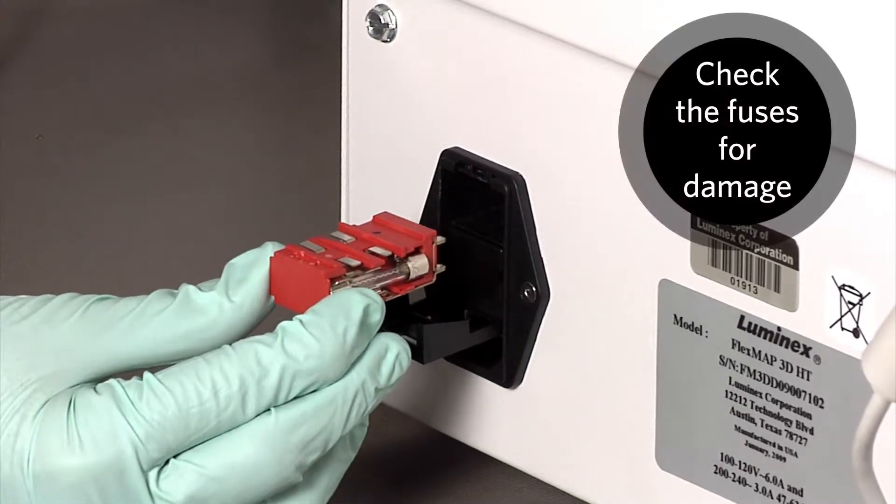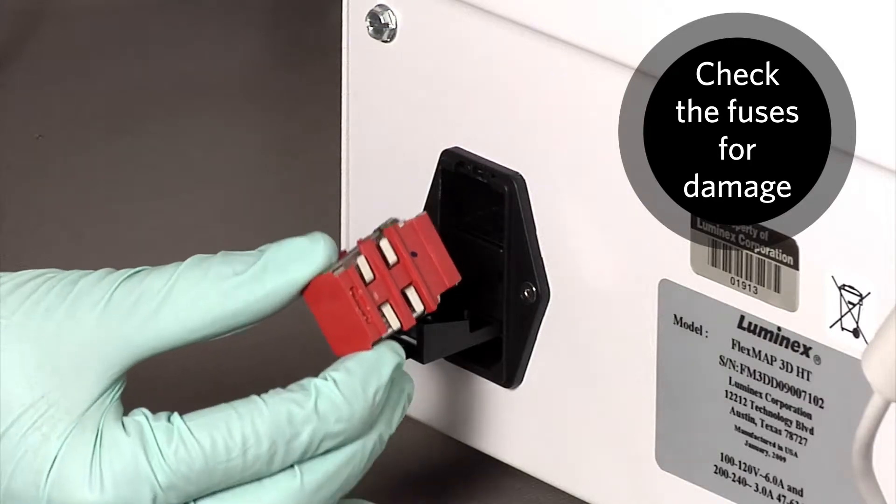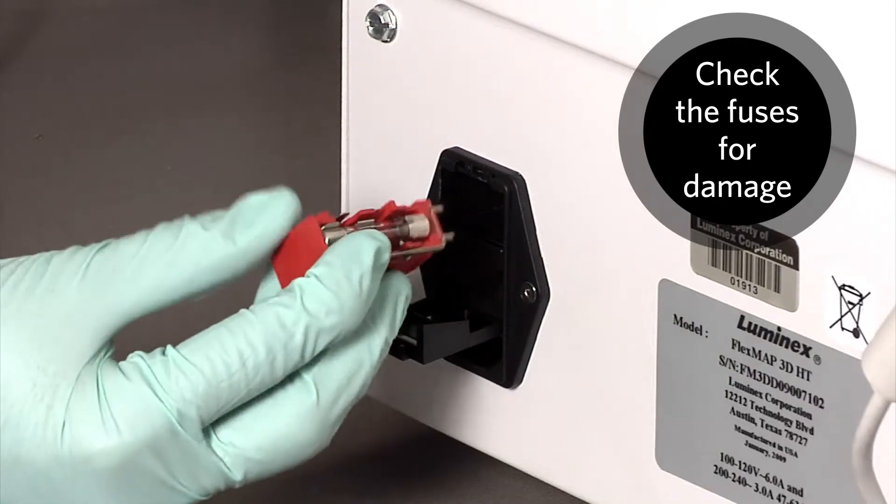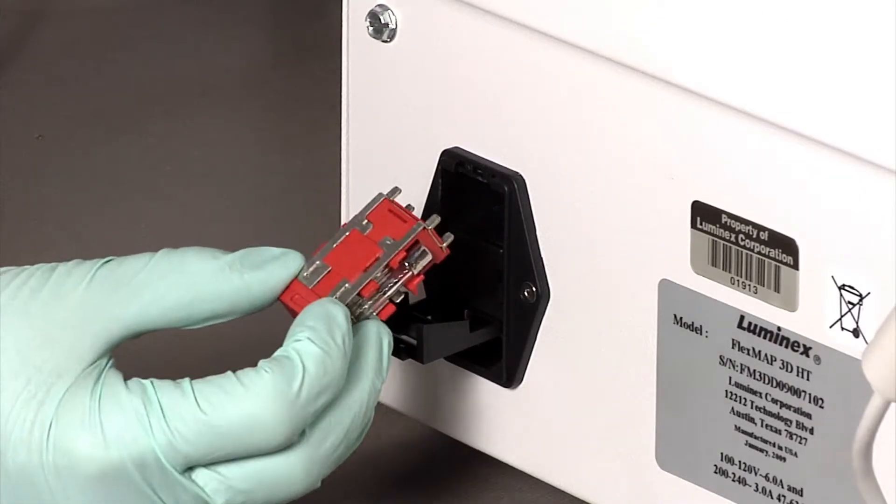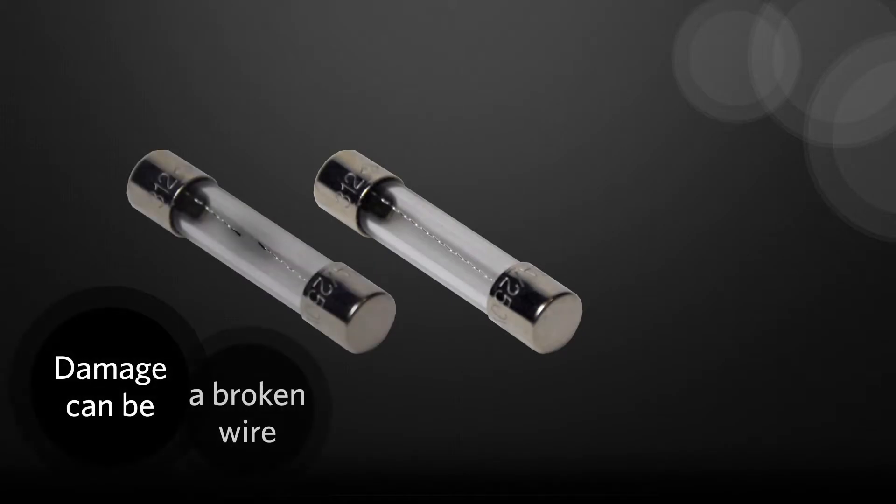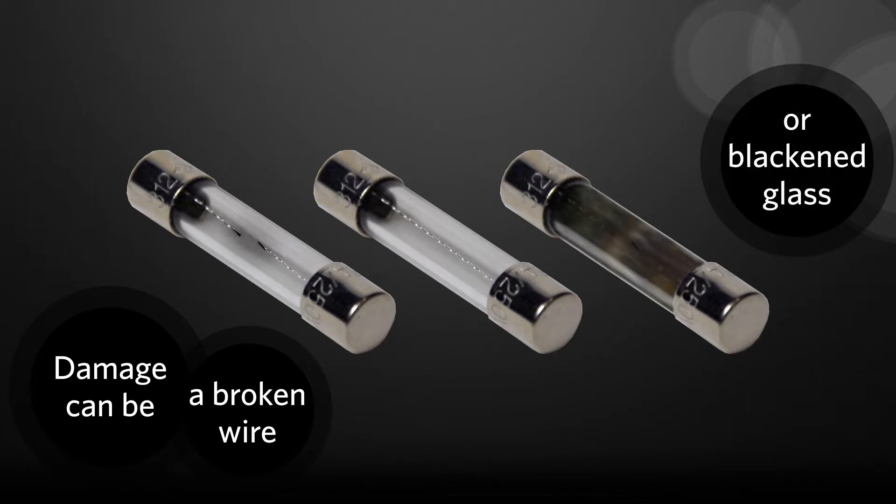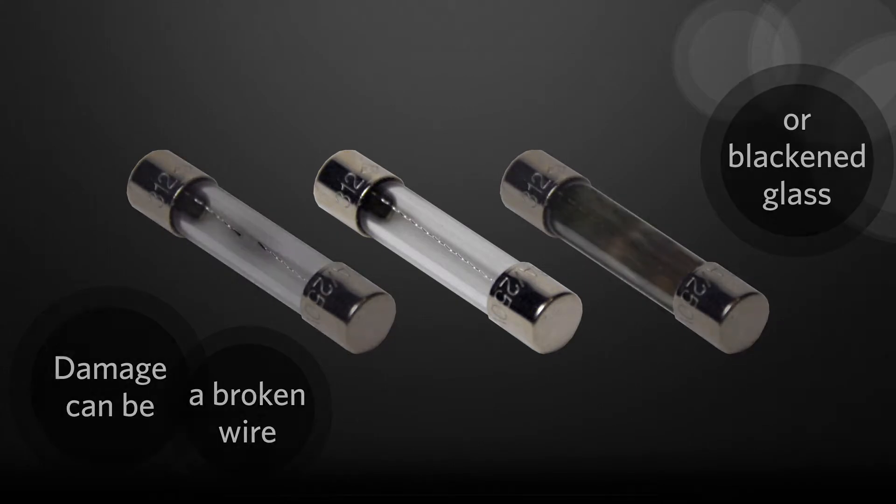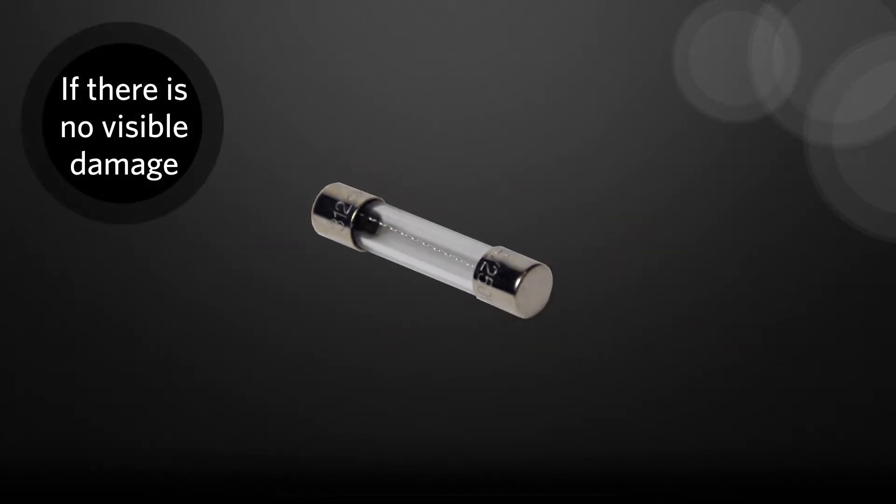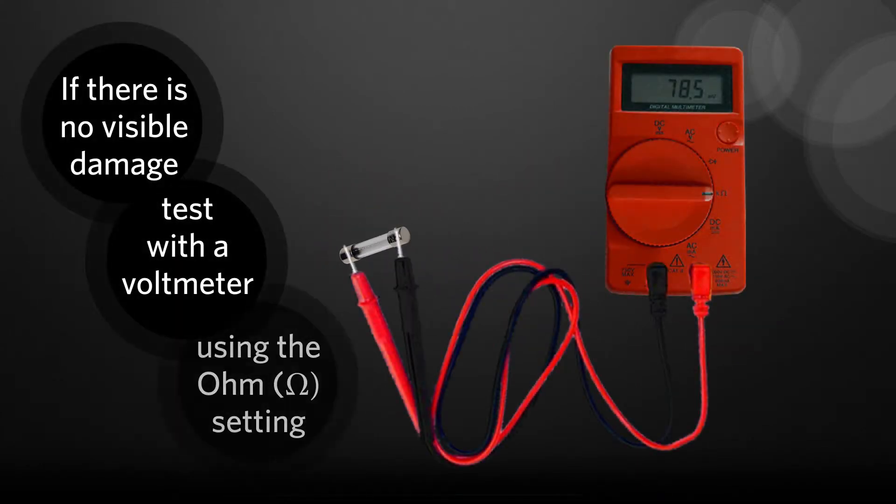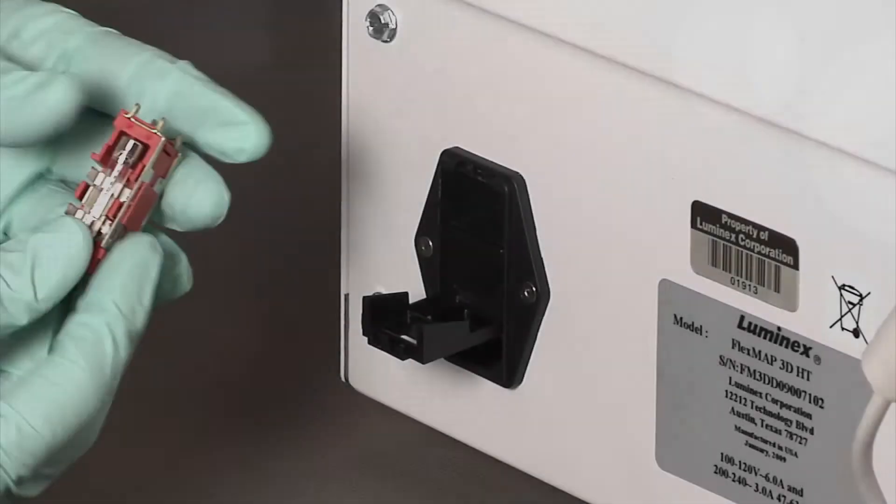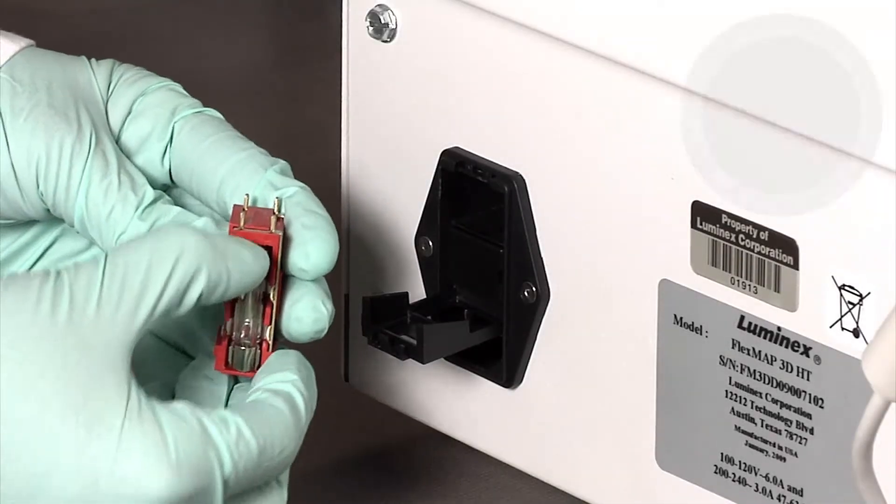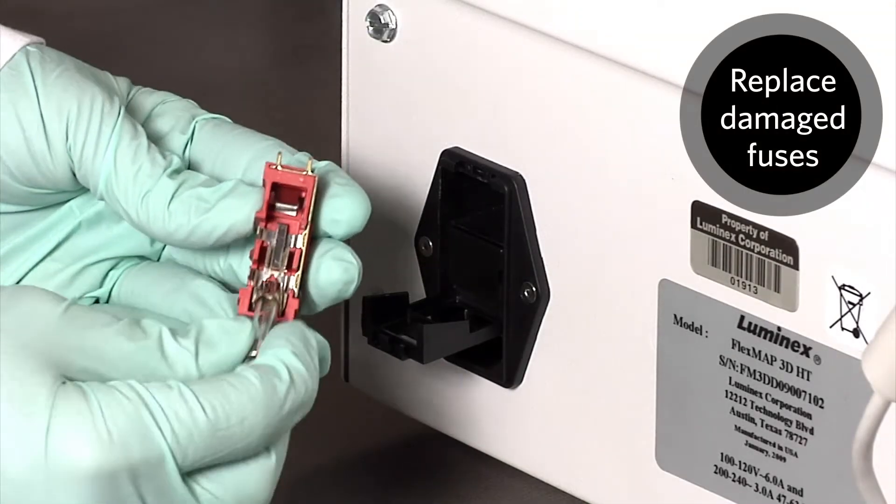Check both the fuses in the cartridge for damage. A fuse can display physical evidence of damage, for example, broken wire or blackened glass. If it displays no physical evidence, test it for continuity with the ohm function of a voltmeter. Replace damaged fuses with the type specified earlier.